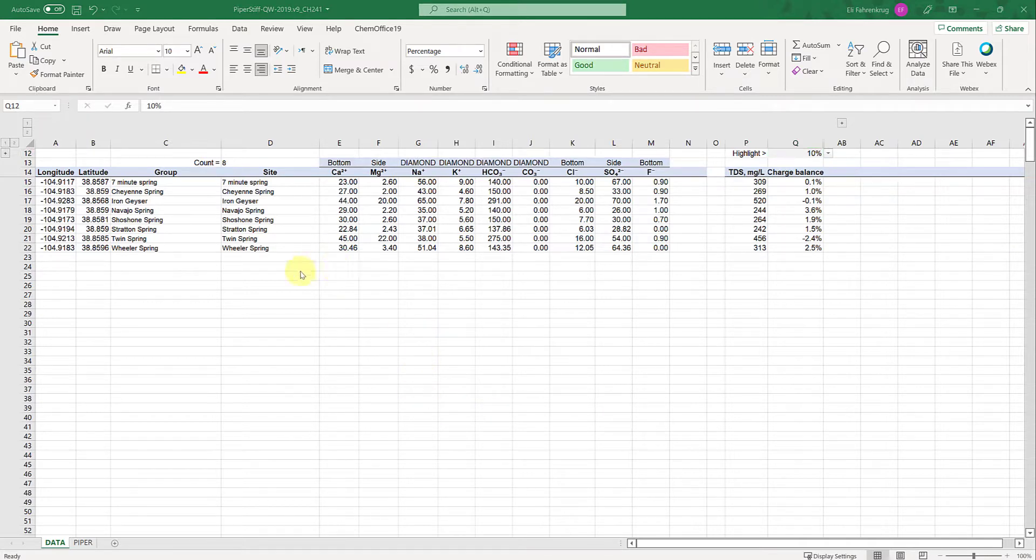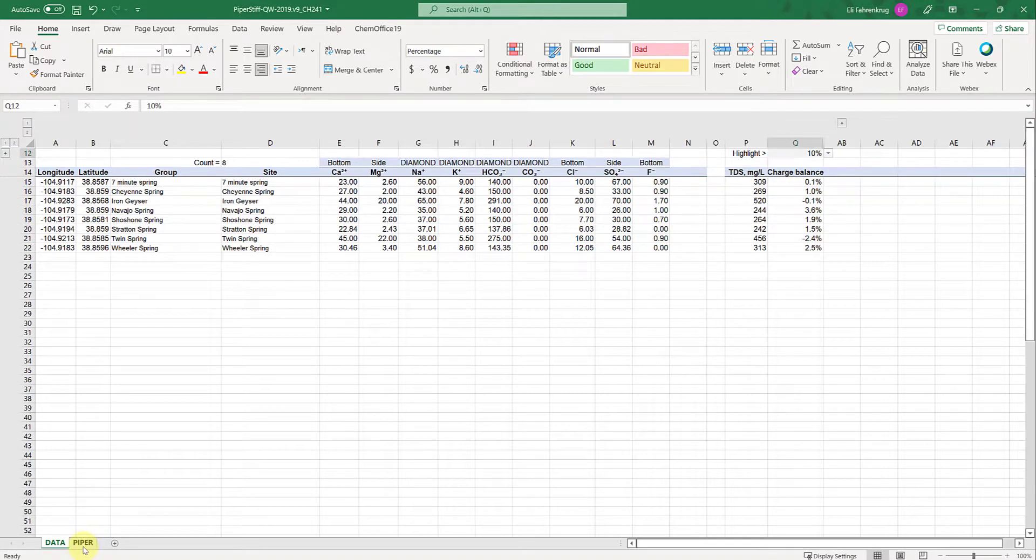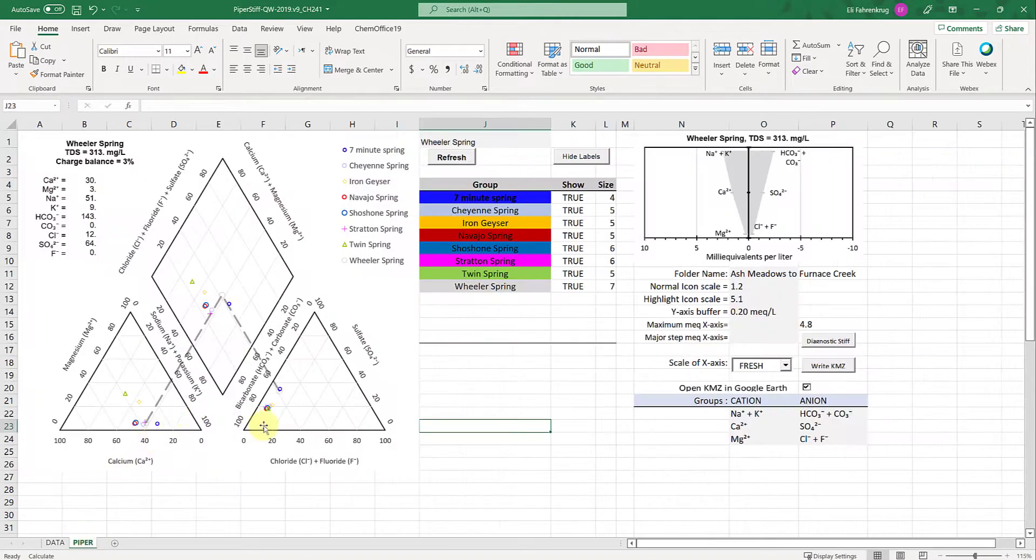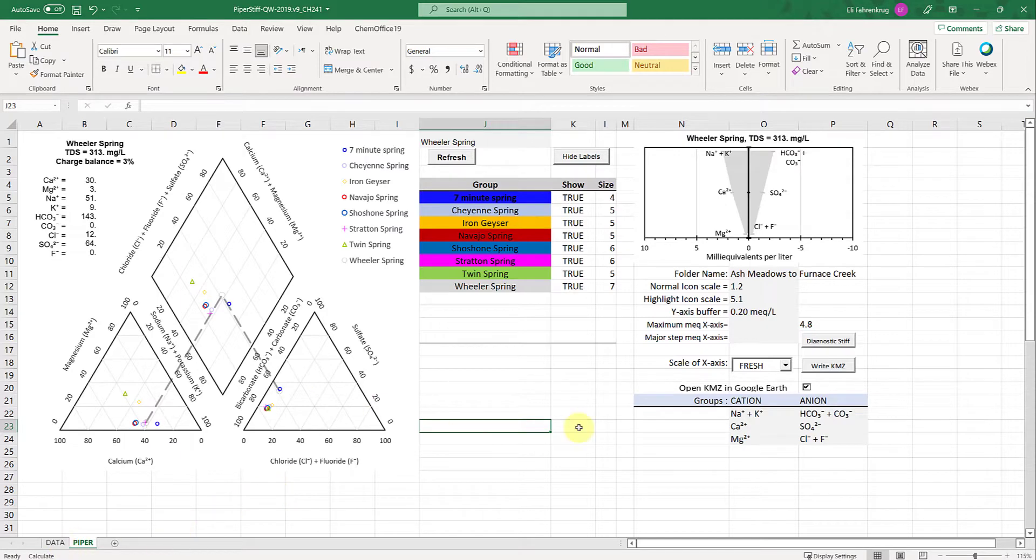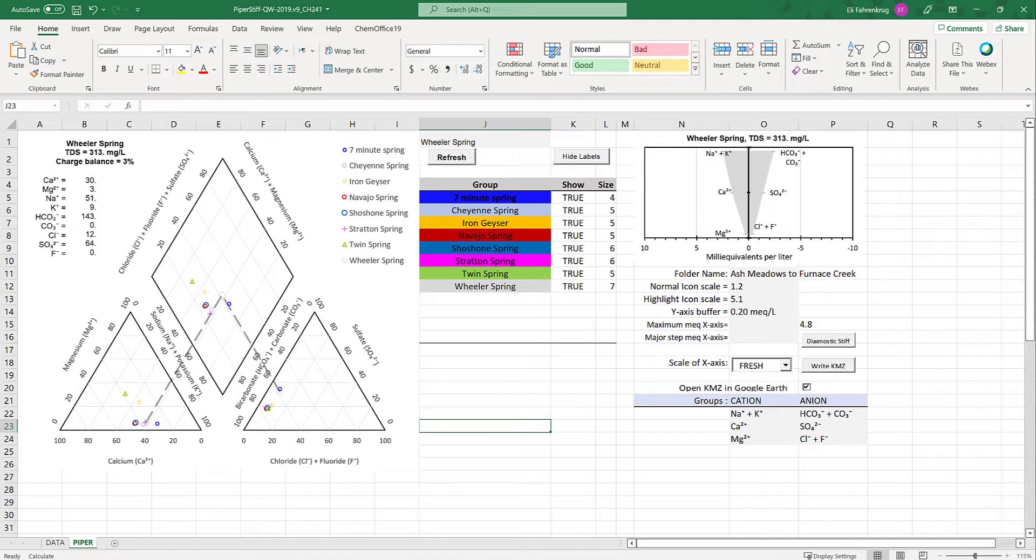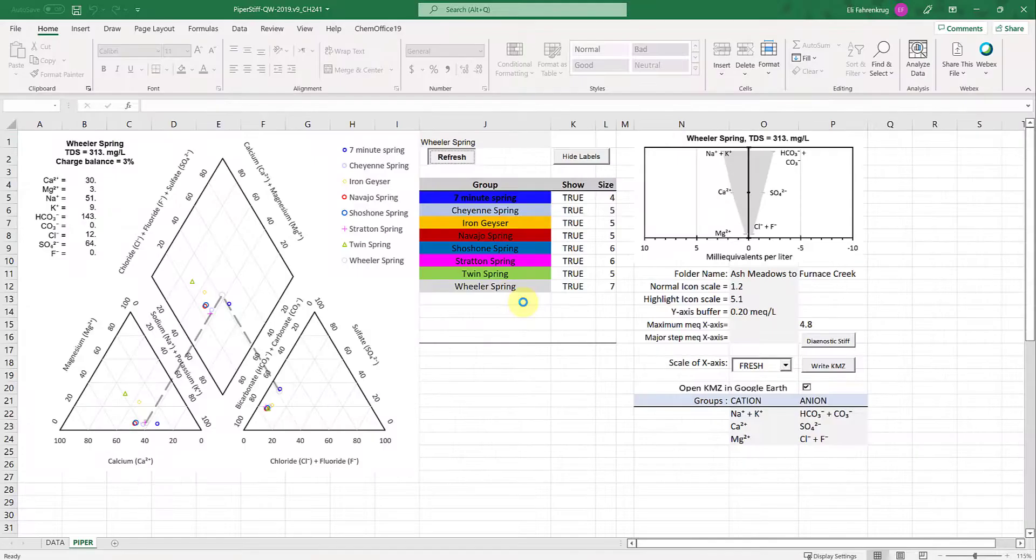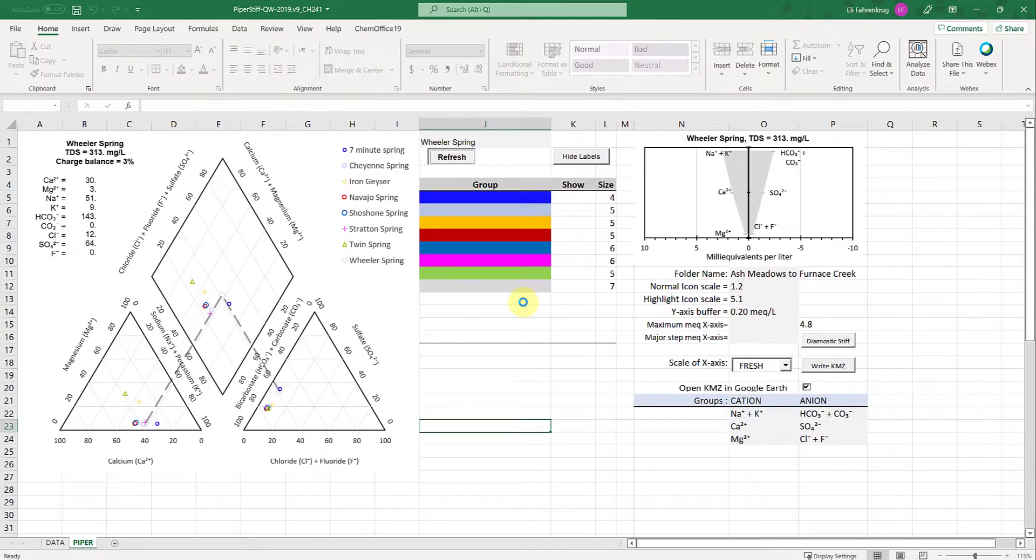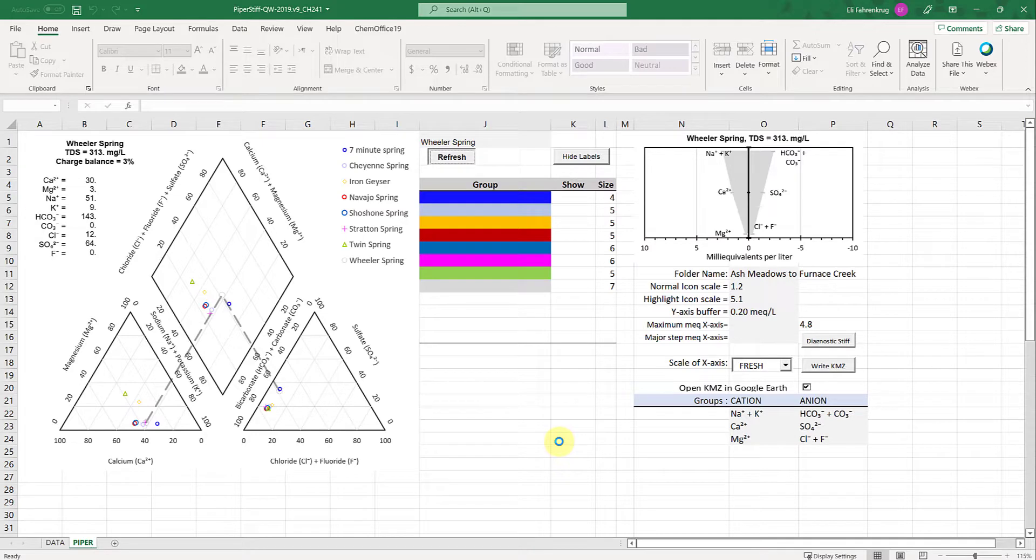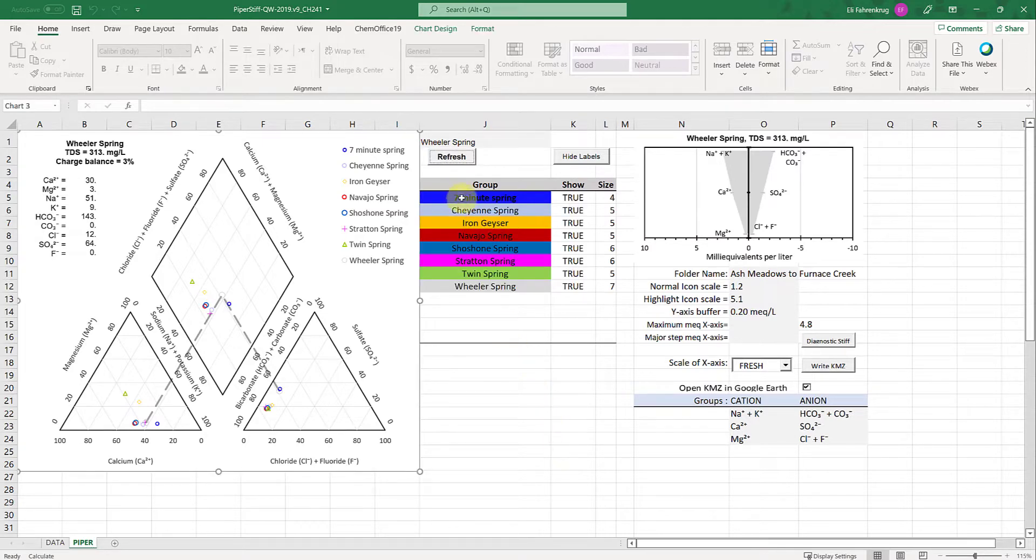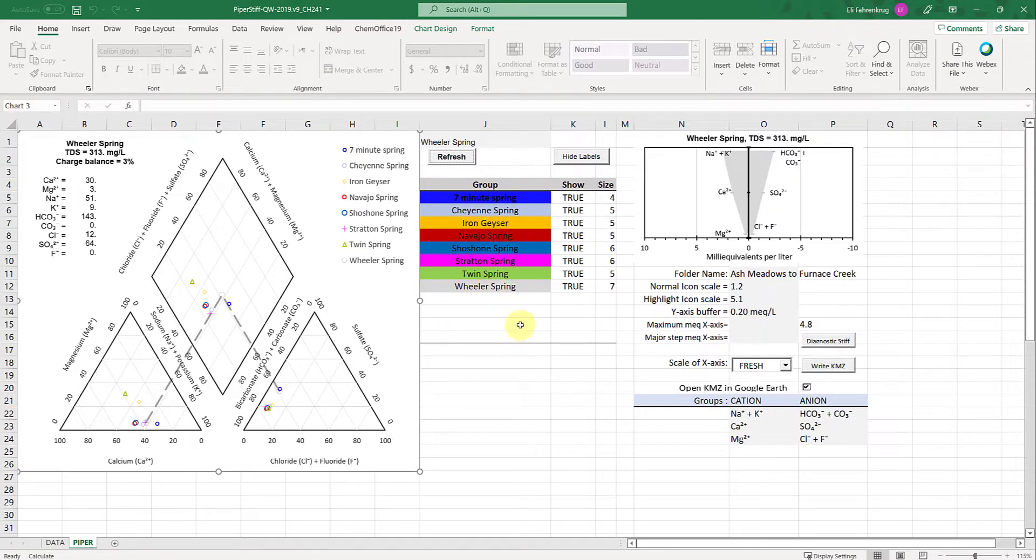Once you have your data in here, go to the Piper tab. This grouping needs to be updated based on your group names. The first thing you want to do is press refresh. It will populate and grab data from those columns. In this case they're all the same because I didn't change them, and then it will plot everything on this plot.